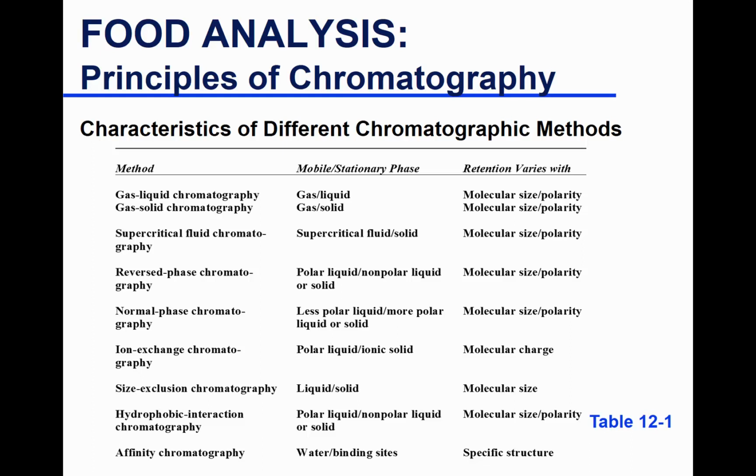Once we cover all of these, this would be a nice summary table to go back to and summarize the information you learned in terms of mobile phase, stationary phase, and the retention. Meaning, do you know that term, retention? Claire, what is retention? How long it stays in the column.